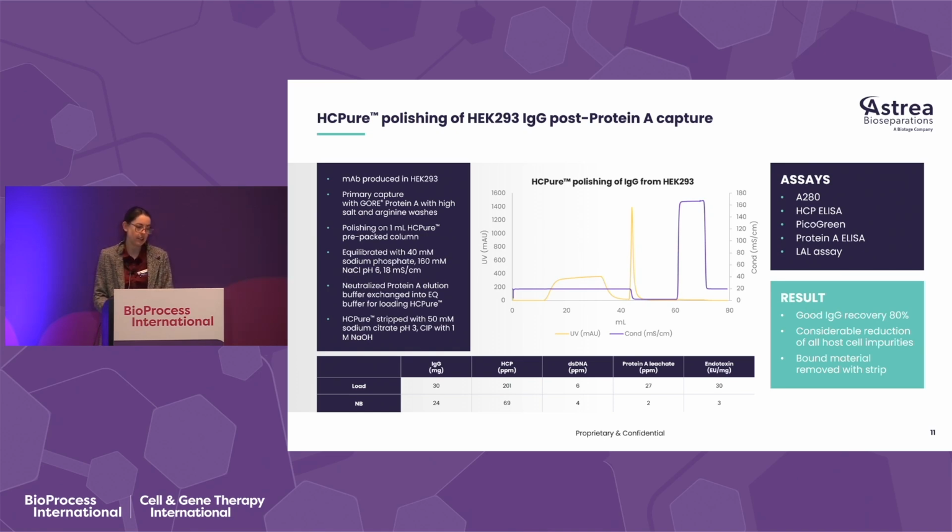And we managed again to get really good removal of the HCPs, good recovery of IgG, and the endotoxin was also decreased a lot by this step as well.